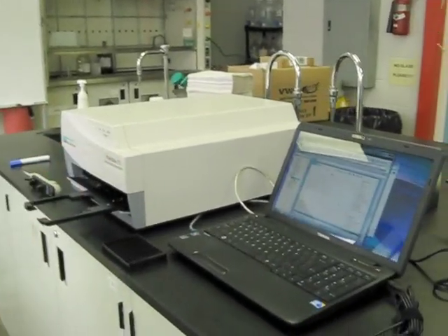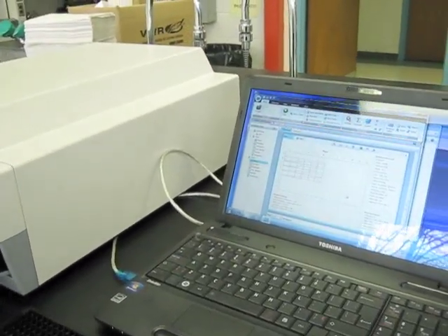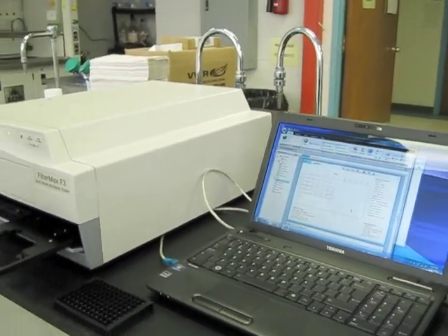Hello, my name is Mike, and I'm going to talk to you guys about the procedure part. And this is the plate reader. You're going to set up the plate reader in fluorometer mode. The parameters are already set.